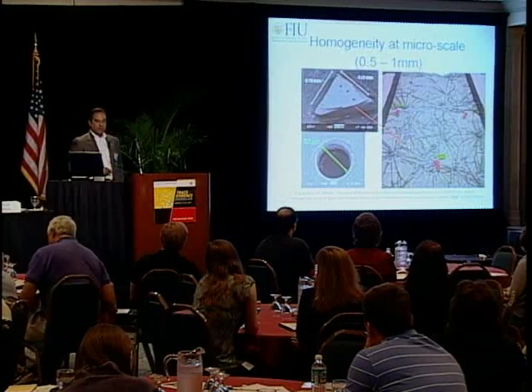And there have been some reports, some papers that suggest that you need at least 30 by 30 by 30 micron cube of glass in order to characterize it well, in order to get a homogeneous sample. Even so, removing this very small amount of material, we get very good detection limits, so sub-part per million. This allows us to do very good analysis of this material.